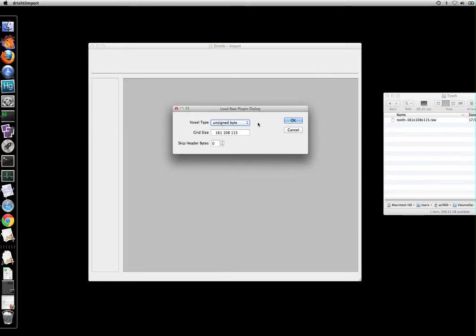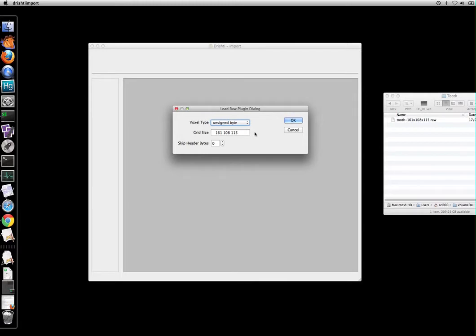This single byte is then followed by three integers, four bytes each, and this is the grid size. So the three integers define the grid size of the volume. Now if your raw data doesn't have the header then you will get wrong values here. Essentially you will get garbage here.